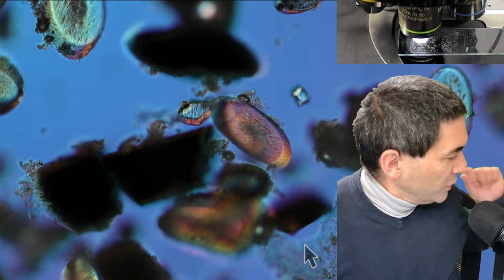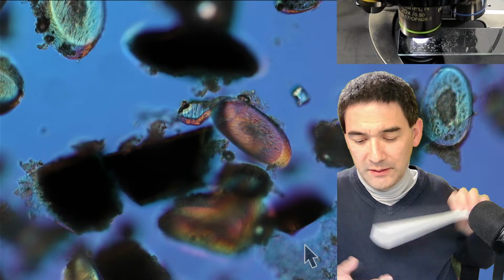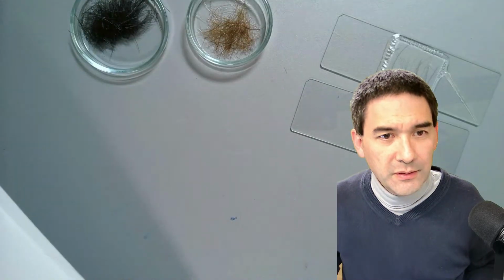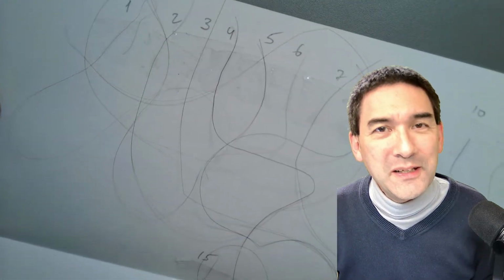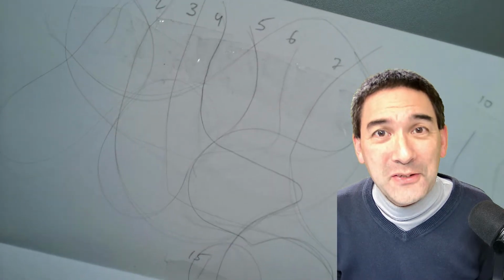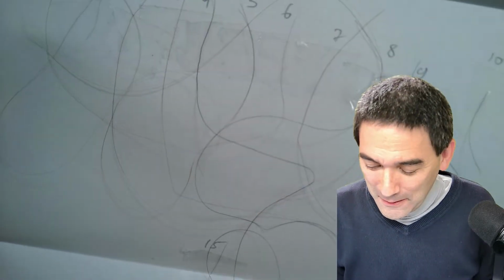So I'm going to show you a little bit what I got here. And this is how I collected it. I'm going to show you the desk view here. By the way, these are all some of my hair, which I'll be looking at today. These are basically 18 hair from my students that I collected yesterday. I asked them, are you willing to give me one of your hair so that I have a topic to talk about during the live stream? So here it is.